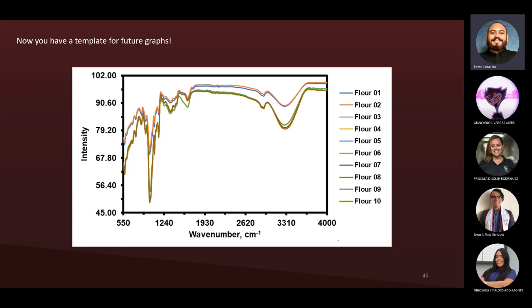The only bad thing about this is that it doesn't give you the axis names, because, rightly so, it's not going to assume that you have exactly the same thing. So it's not going to give you the names for the labels, but it will maintain the aesthetic of the graph. It's going to save a lot, but a lot of time when you want to merge, organize, and then graph.